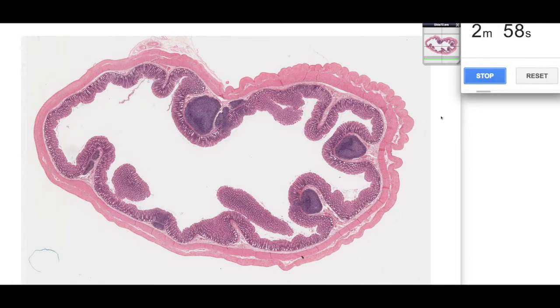Okay, so first of all we can see several features here. Now the first thing I want to point out is that this slide is not from a human. So how can we tell that it's not a section from the human? Well, the way we can tell is that we have a complete outer longitudinal layer of the tunica muscularis. You can see it's complete here.